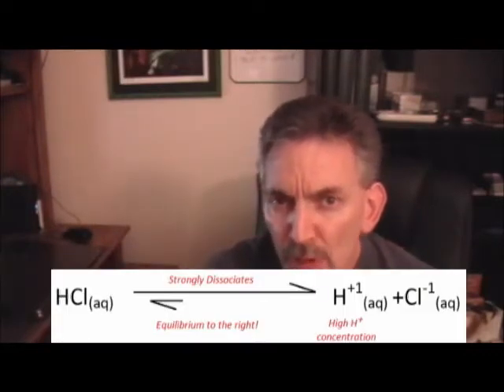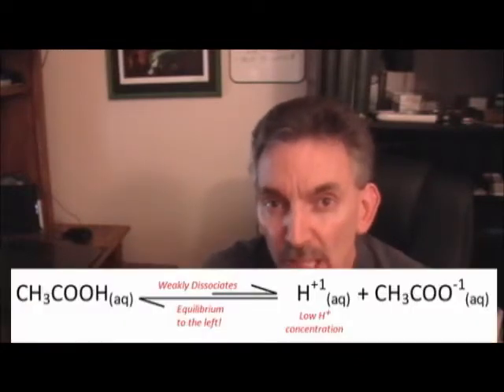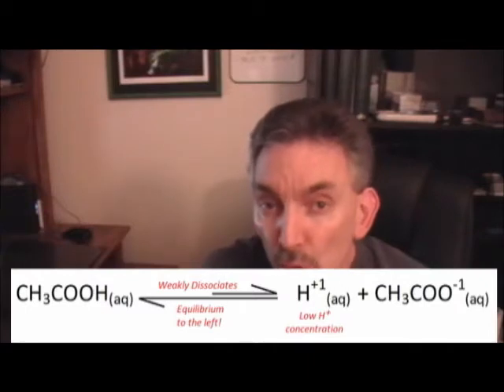So the acids which work the fastest and give the quickest reaction are going to be the ones which fully dissociate by giving the highest concentration of hydrogen ions. So you'll look at your results, and the fast reactions will be for the strong acids.